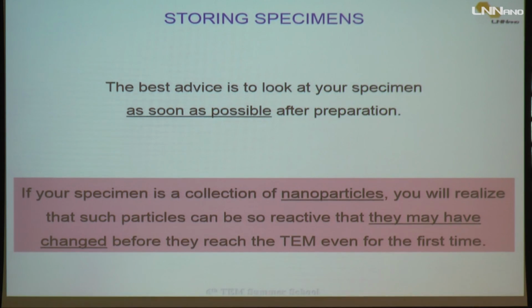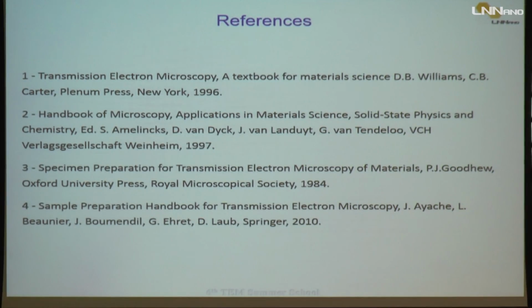And then it's good practice for scientific investigation to prepare your sample and look at it in the microscope, work with your sample as soon as possible after preparation. It's good advice to minimize strange results that may change your work.